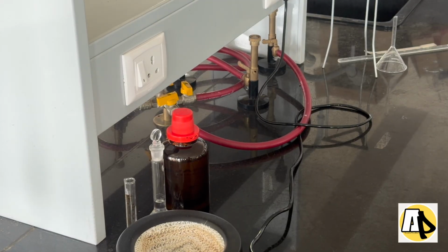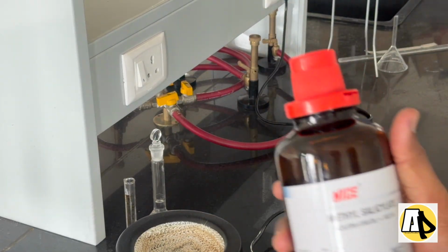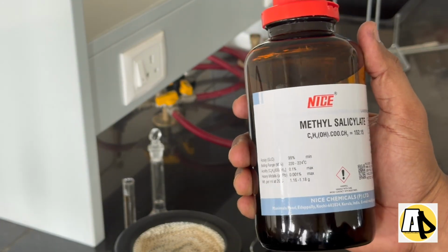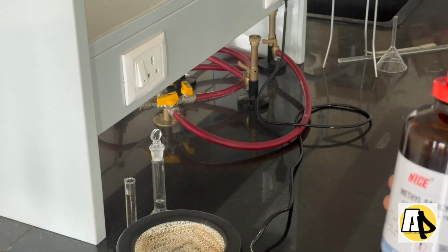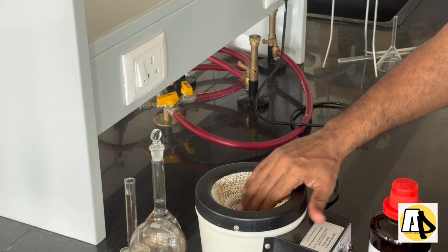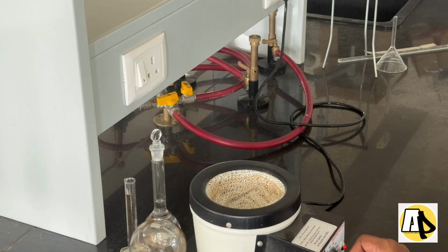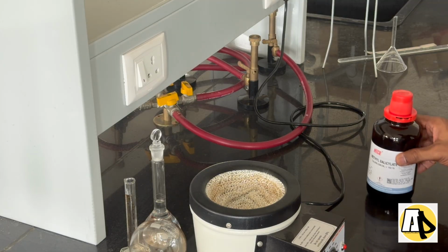So now we are going to start the synthesis of salicylic acid from methyl salicylate. We have done all the calculation part. We have calculated the theoretical yield and the practical yield also. This is the reflux setup. Mantle. Check it is working. Yes, absolutely it is working.